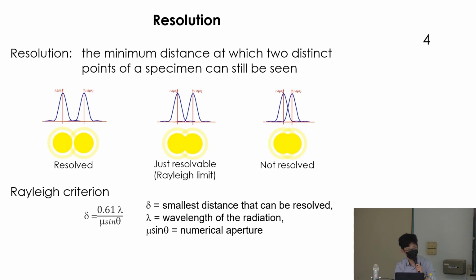The bottom one is a constant number for a given microscope, so we temporarily ignore it now. If you look at this, you can see that for a microscope, your resolution is correlated to the wavelength of the incident beam. Is that okay? Nearly your resolution is about half, 0.6 or half, of the wavelength.